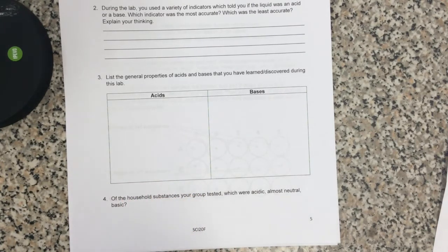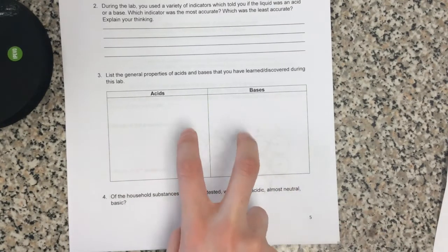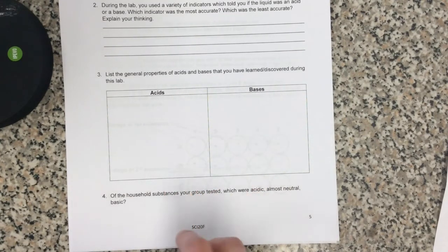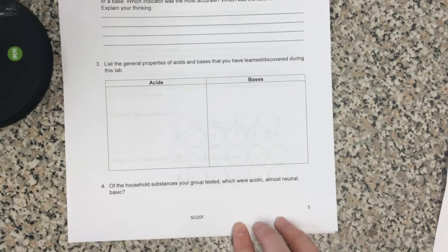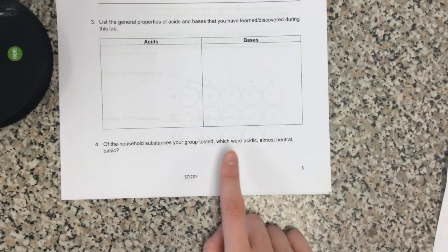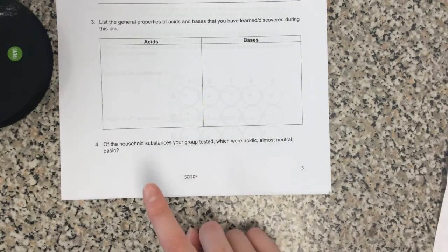It could be how they taste, whether or not they conduct electricity, maybe what pH range it has, and do the same to compare them. So compare your acids and bases on those characteristics. And the last question is just comparing your household substances. Which ones were acidic, almost neutral, or basic?